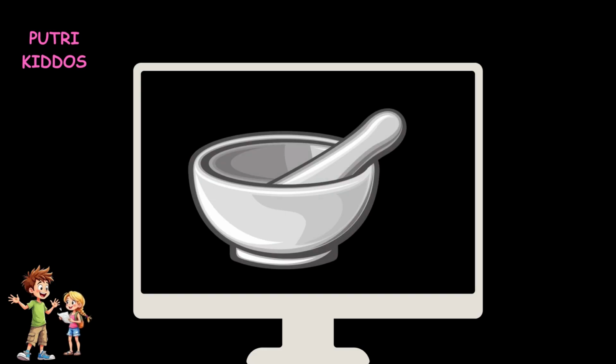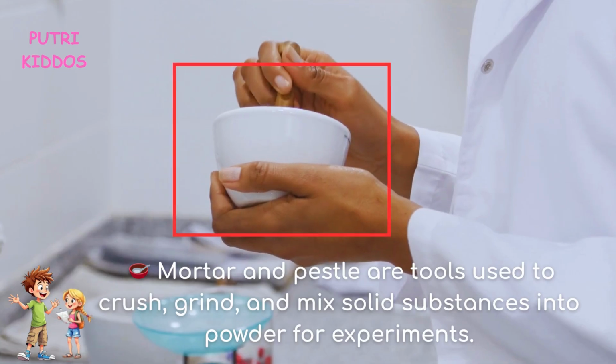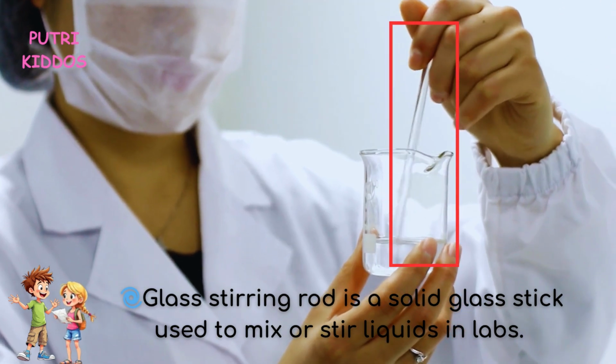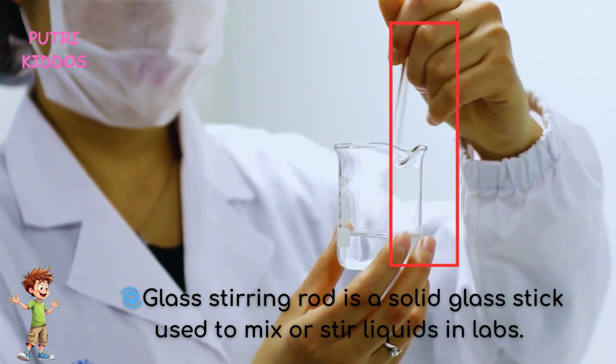13. Mortar and pestle. Mortar and pestle are tools used to crush, grind, and mix solid substances into powder for experiments. 14. Glass stirring rod. A glass stirring rod is a solid glass stick used to mix or stir liquids in labs.